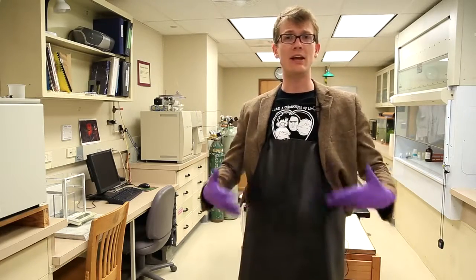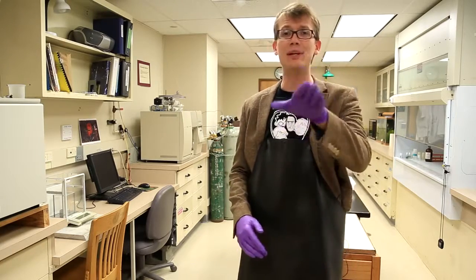This is an apron. It protects you and your clothes just a bit extra in case you're working with something hazardous like concentrated acids. Aprons are nice because they're easy to get off if you spill something on them. Well, if you're wearing pants, you might hesitate a bit too long before you ditch them. Which reminds me, if you spill more than just a bit of anything super bad on your pants, modesty goes out the window. Just take them off.